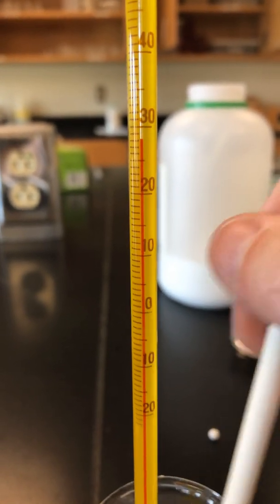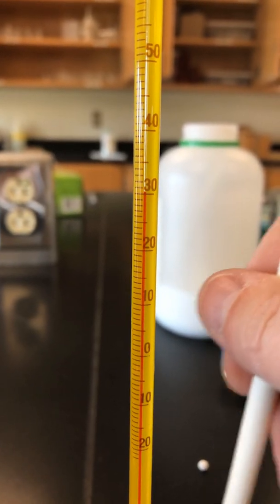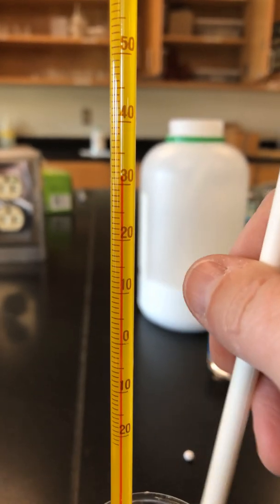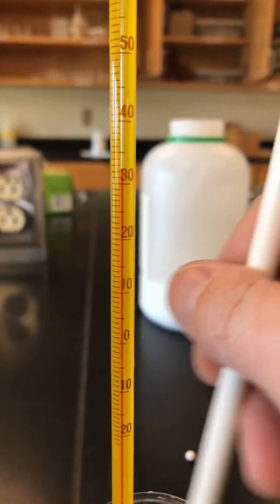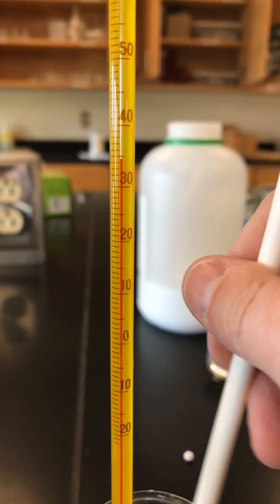Is the temperature increasing or decreasing? As soon as the temperature stops changing, record this as the solution or mixture's temperature.